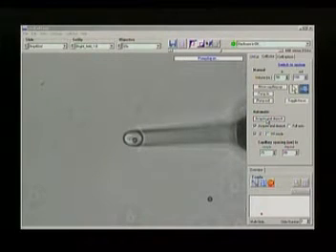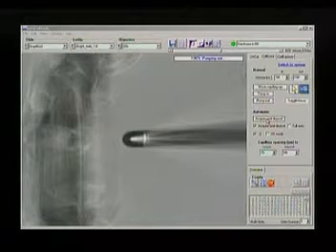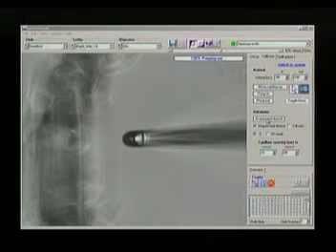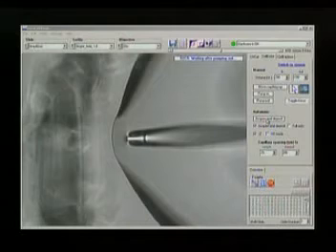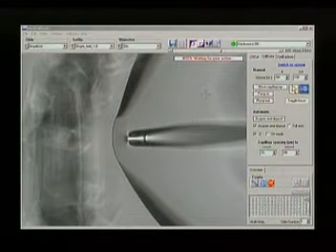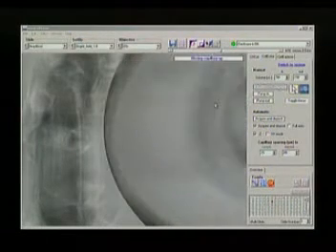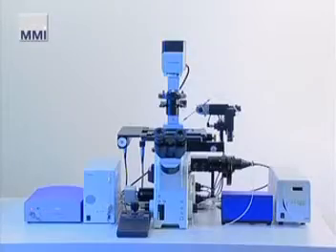The isolation of single and rare cells from tiny sample sources is a prerequisite for their genotypic and phenotypic characterization. The MMI selector is the starting point for a new integrated workflow.